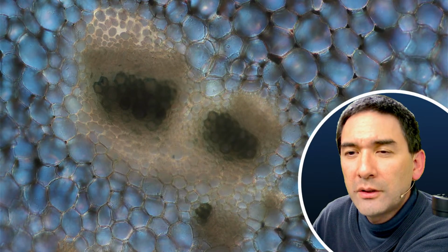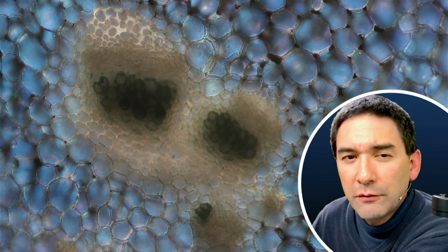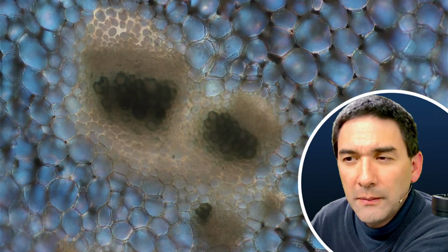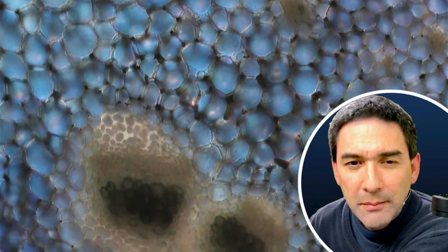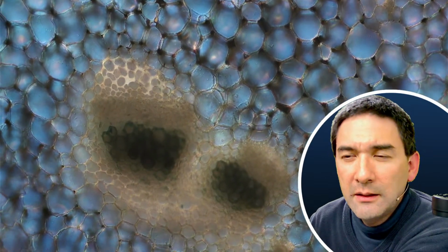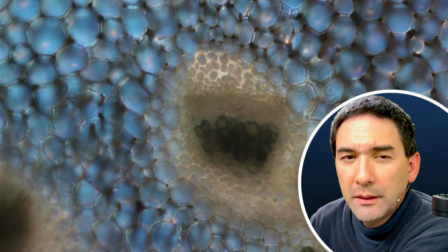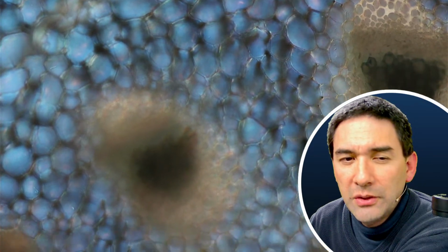Have you ever heard about gum damar as a substitute for Canada balsam, a mounting medium? I'm about to make some. I've heard about it, but never used it. I know that gum arabic has also been used in some mounting media, maybe even as an additive. But gum damar, I don't know if it's a water-based mounting medium.